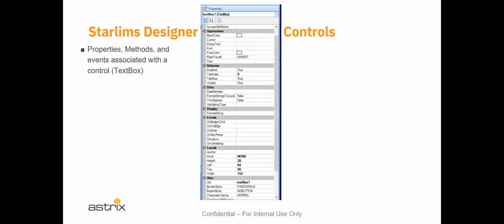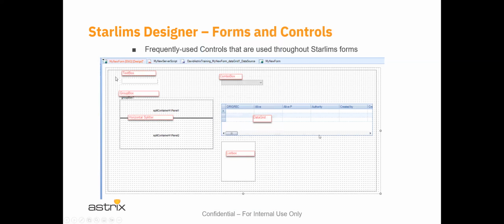Here's a data grid. Oh boy, data grid. Again, populated by a back-end data source, and it's one of the properties and methods associated with the data grid to select which columns appear and which columns might be editable. It's still doing this auto forwarding thing. I'm so sorry about that, folks.